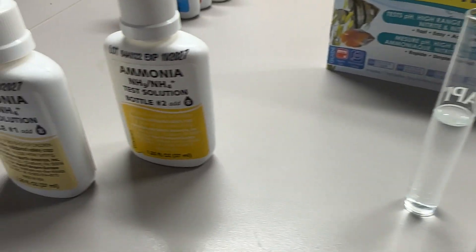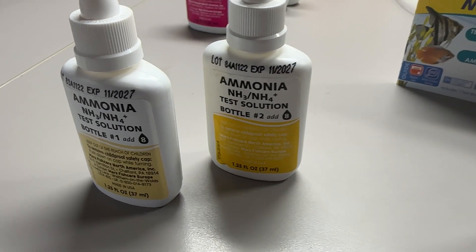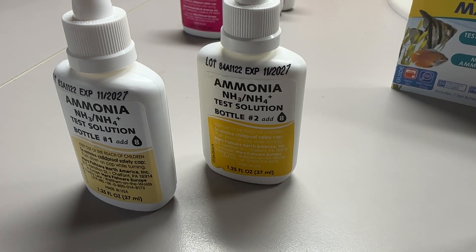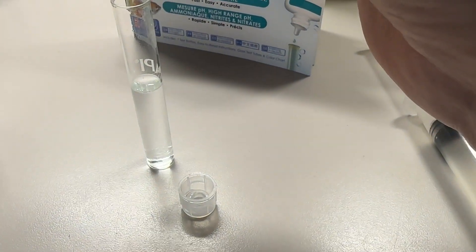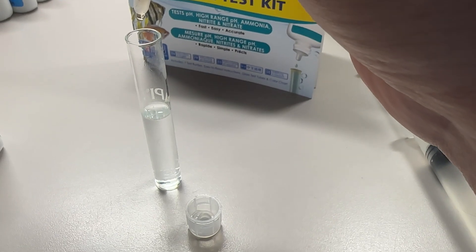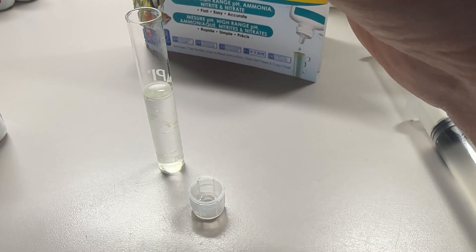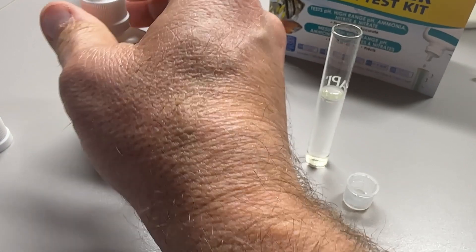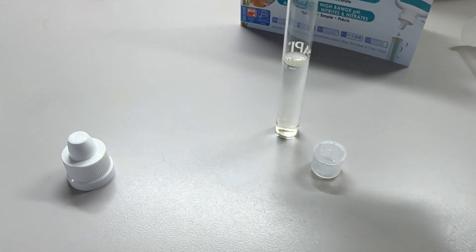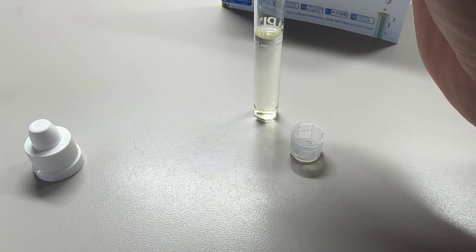We're going to put eight drops of ammonia solution number one and eight drops of ammonia number two. Shake bottle number one vigorously for five seconds, turn it upside down, and add eight drops: one, two, three, four, five, six, seven, eight. Then go straight to solution number two and add eight more drops: two, three, four, five, six, seven, eight.